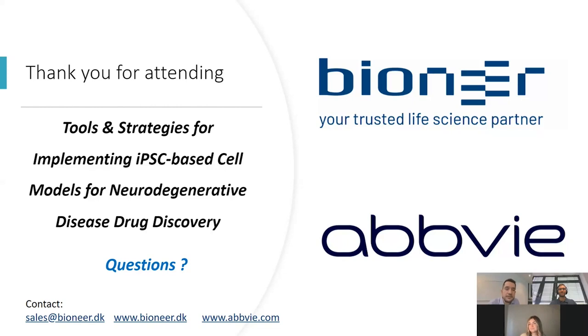Yeah, it's indeed surprising. It's very seldom that we are asked about checking for off-target effects. We have done this in the past by sequencing analyses. So we just sequenced the most related sequences. When you are designing a CRISPR, you're normally told about related sequences, so you're getting a certain gene and you're being told that this gene also can be targeted by the CRISPR with only two or three mismatches.